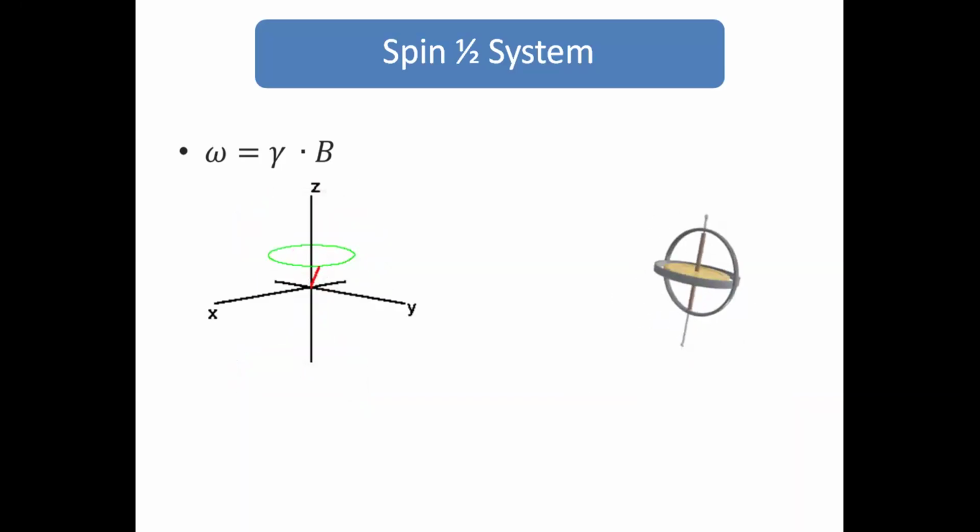Okay, so you can see this. I hope you are able to see the gyroscope that is spinning. It shows how the generated NMR signal behaves by disturbing the equilibrium, and when it goes back to the original state, before that it revolves around the applied static magnetic field direction, that is the z direction, and then goes back to the equilibrium state.